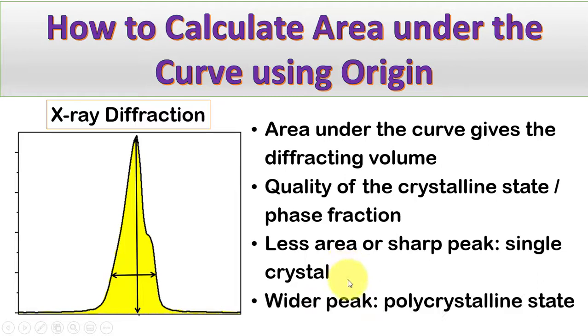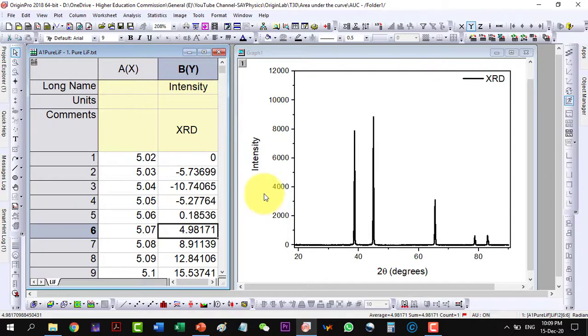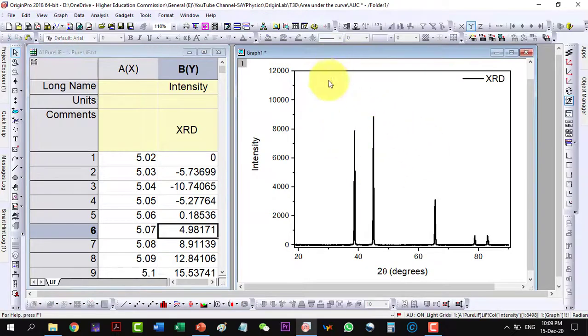Now, in order to calculate area under the curve, I am plotting this XRD data here. I will now find the area under these curves. So I can focus on a specific curve or all the curves at the same time. To find area under the curve, I will have to go to Analysis.